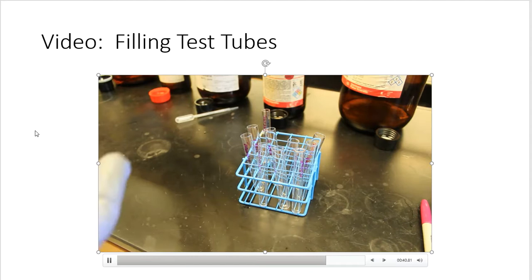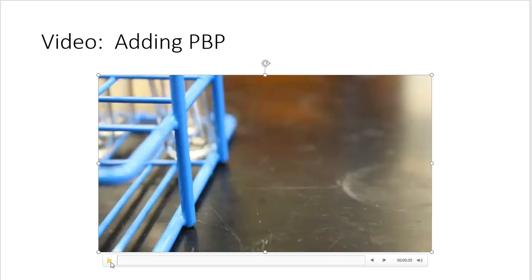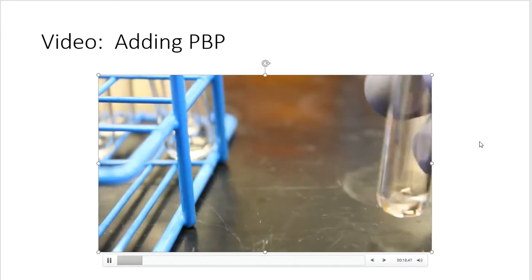And then the next time we see each other, or the next time that you watch me, we can add the PBP to those solutions. All right, so PBP is getting ready to be added to all of my test tubes that I've just prepped. So we're going to take this one by one. I'll call out the names. I'll tell you which one that I've grabbed, and I'll add the PBP in front of you live, so that way you can make your observations, because that's what this is all about, folks.